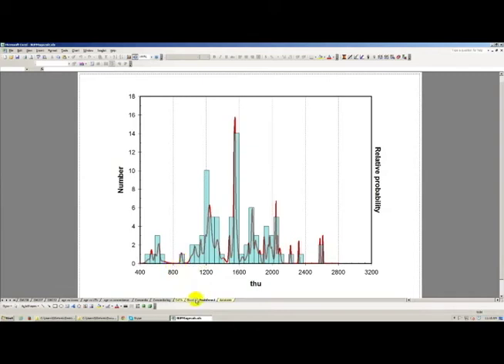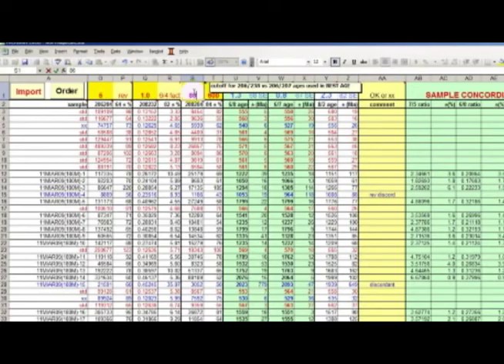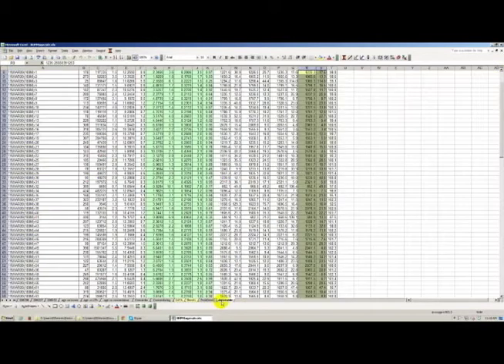So the safe way to go would be to go back to sheet 1, and on that threshold, that cutoff, set 800, and then hit order again. So when you change something in this sheet 1 tab and then hit order, it's going to get refreshed in the sheet 1 tab, but it's not going to get refreshed in the data table.